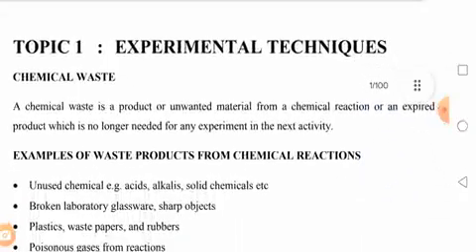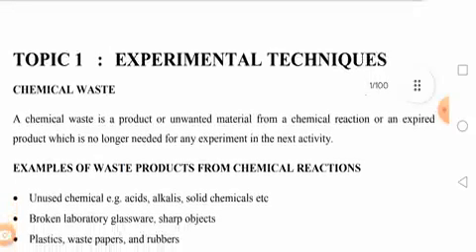First of all, before we go into details, let us look at chemical waste. Suppose you are in the laboratory. In the laboratory, you have a lot of waste, so we have to describe it properly. We have different types of waste, but these should be chemical waste, my waste from the laboratory, more especially from the chemicals.